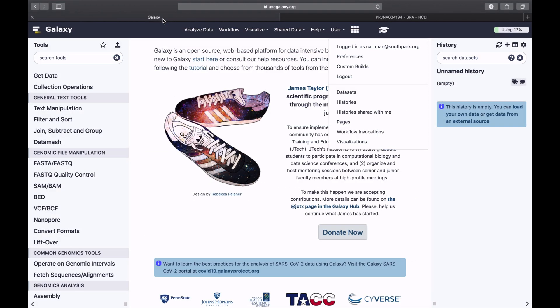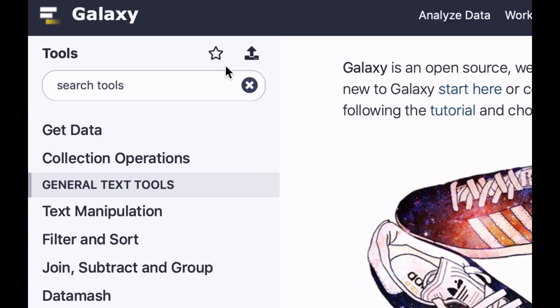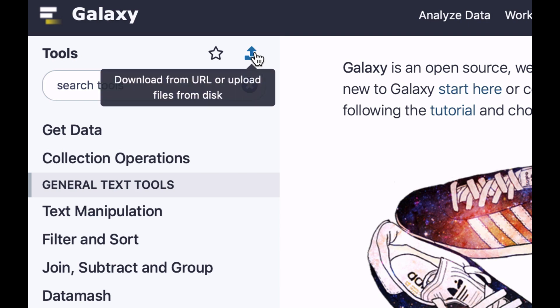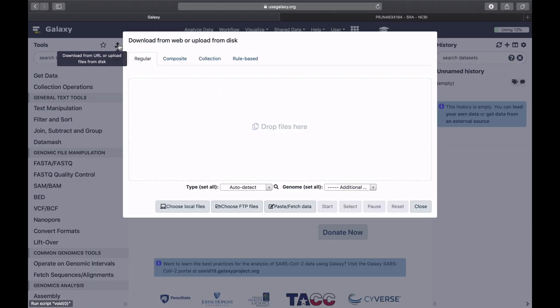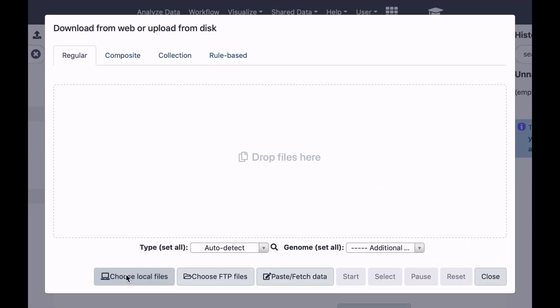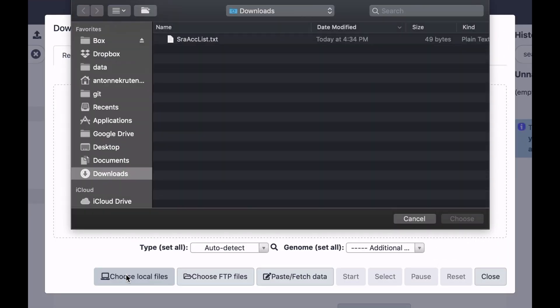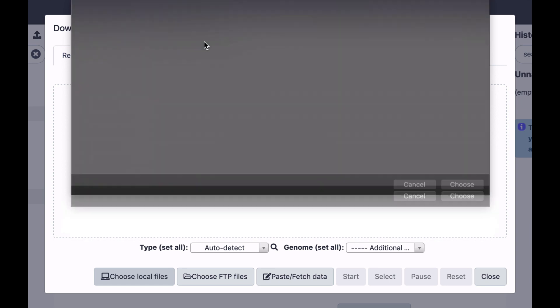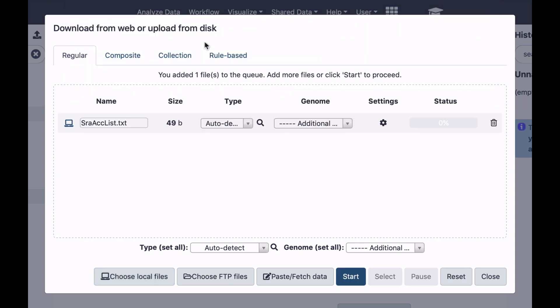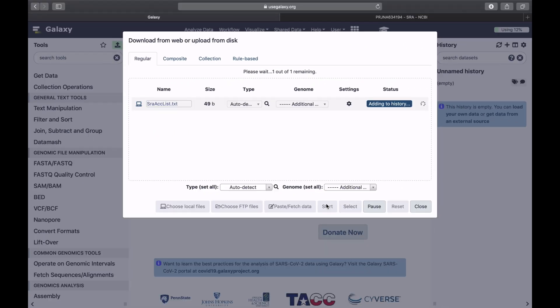Now I'm going to switch to Galaxy. Click on the Upload button. Select Choose Local Files. Select this dataset. Click Start.